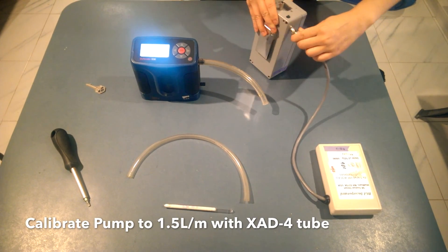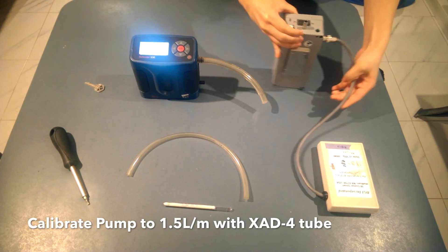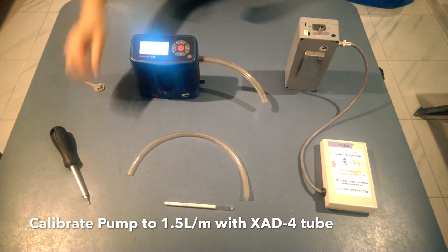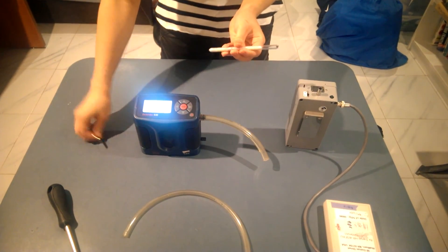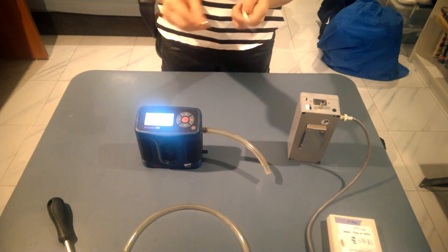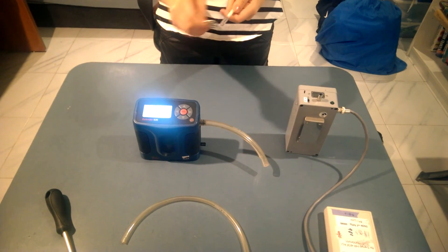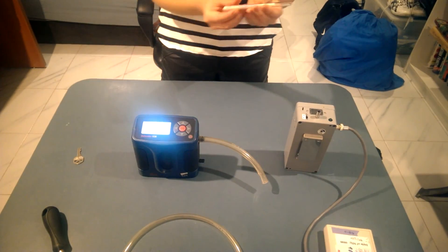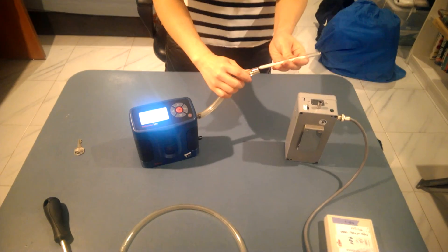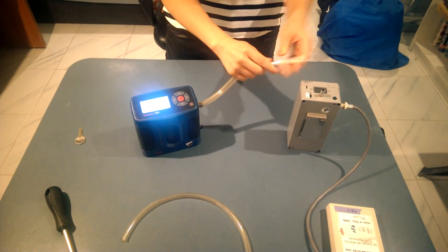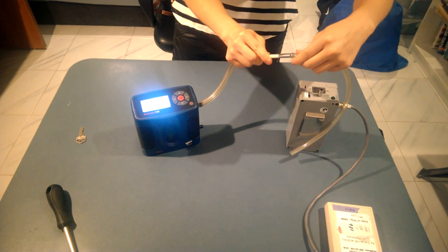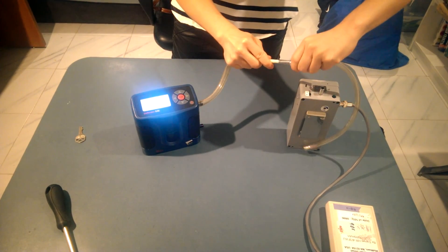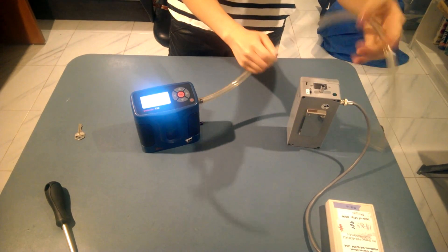To calibrate your pump, attach a fully charged battery pack to the side of your pump. Break both ends off of your XAD4 tube. Then insert the tube and attach it in series in between your calibrator and your pump, with the arrow pointing inwards towards the pump.